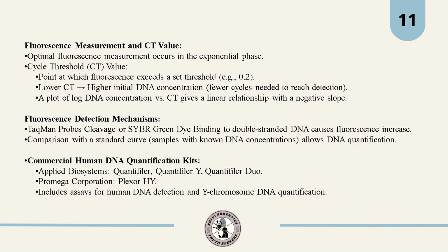If we have a lower CT value for a sample, then it means that the concentration of the DNA extracted from the biological sample was high. Let's assume the threshold value is 15, and we have a CT value which is lower for A and higher for B. For A, the number of cycles it takes to exceed the threshold could be approximately 2 or 3, maybe 5.